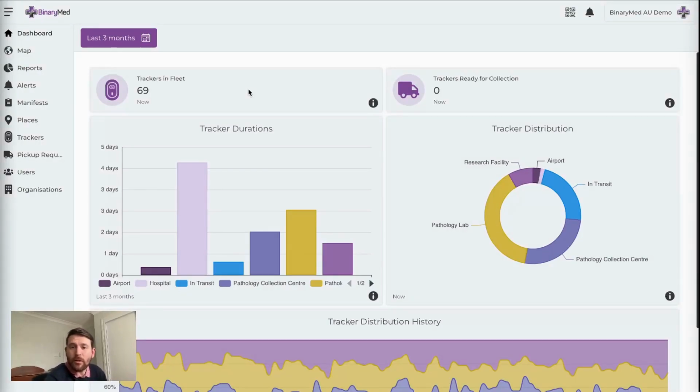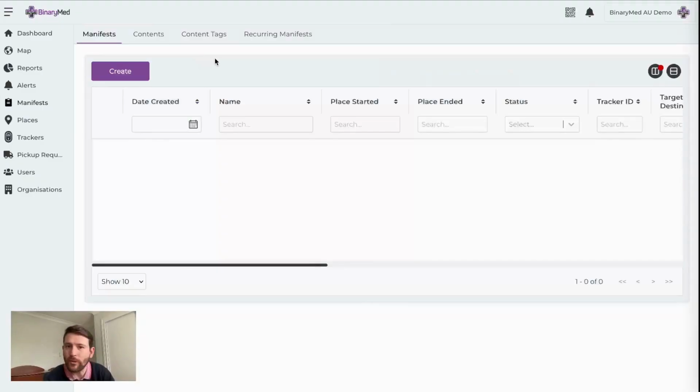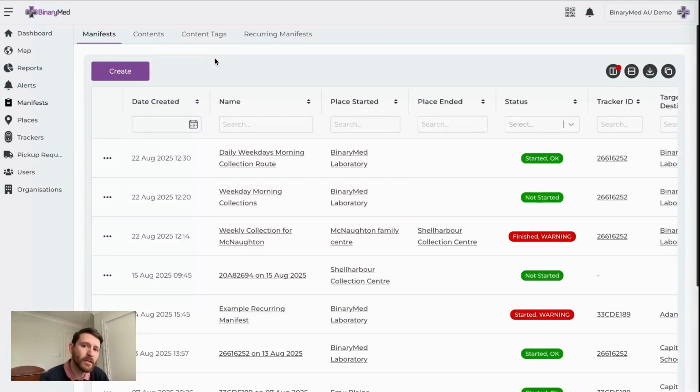Welcome to this quick introduction to manifests and how to create recurring manifests. So a manifest in the BinaryMed platform is a way to capture a journey. It's a way to capture the start place, the end place, who was doing what throughout the journey, and most importantly, what samples or what contents was captured in a manifest.